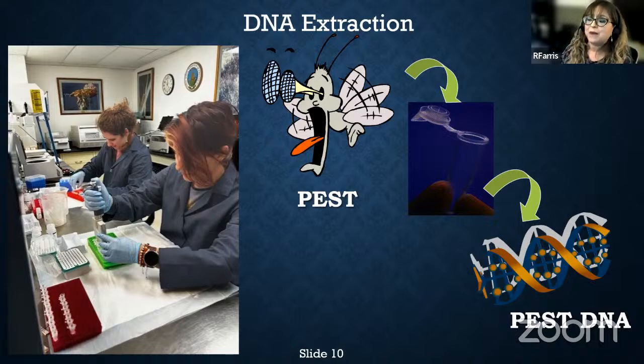Now, what happens actually is we take pests that have already been dead in alcohol, and we place them in these tubes and we crush them. All right. And we have certain instruments that we can use to crush them. The idea is that we want to expose the insides of the insect to the point to where the tissue breaks apart and maybe some of the cells are getting exposed. And that is not where we stop, actually.